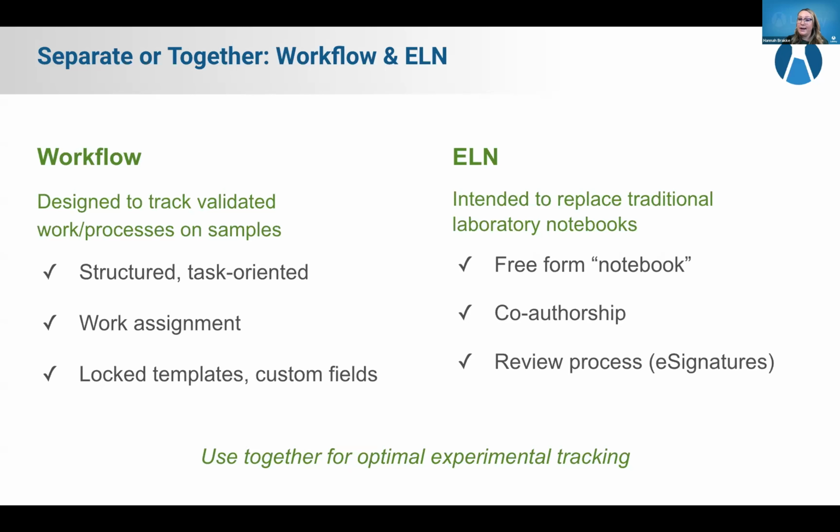Alternatively, our ELN, or electronic lab notebook, that's built in, and it's this data connected notebook, was built to replace traditional laboratory notebooks. And as Doug mentioned, or coming from another ELN that's not centralized and not linked to your sample data, effectively, it is what it sounds like. It's a free form notebook.